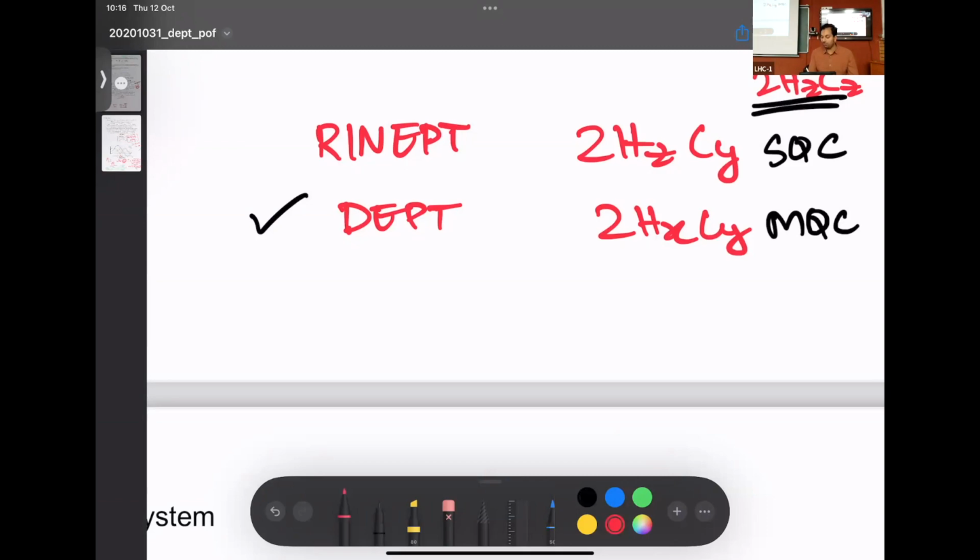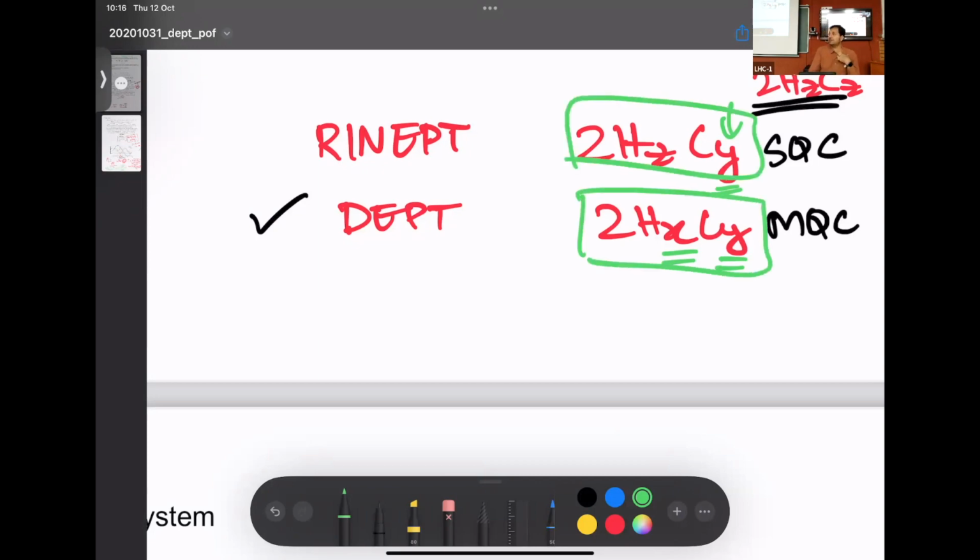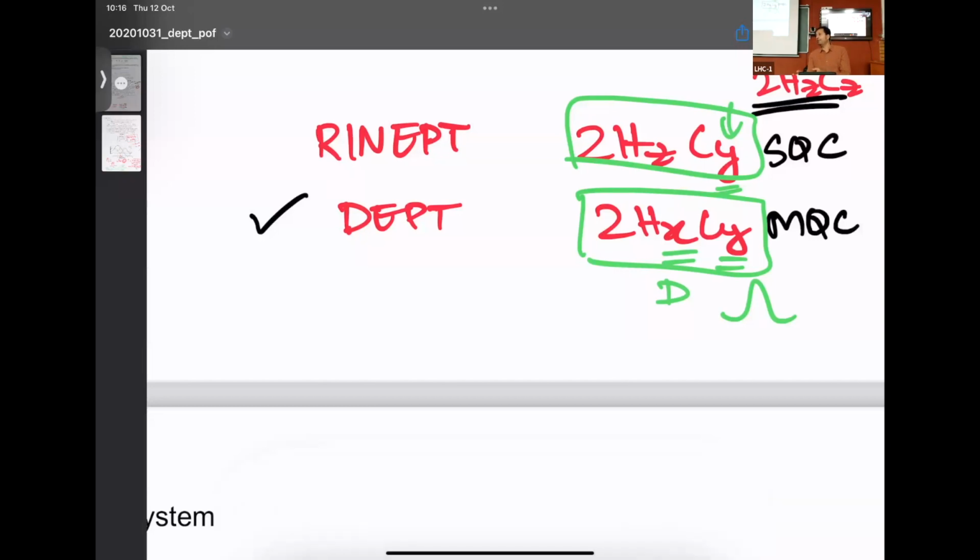Of course, the negative of something like this is that here both are transverse, while there only one is transverse. So the relaxation properties of the density matrix elements that you have created will be different. Although this gives distortionless spectra, they'll have broader lines because both are transverse. I'll give an example to show you what this distortion is and how DEPT does not have it. Anything that you choose in life comes with a compromise. You cannot win every way.